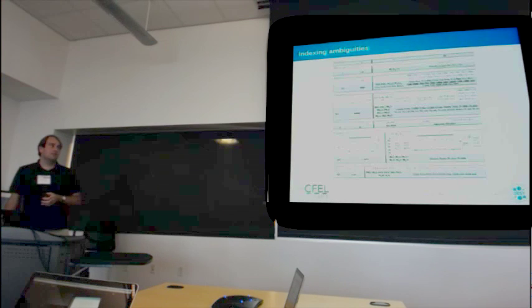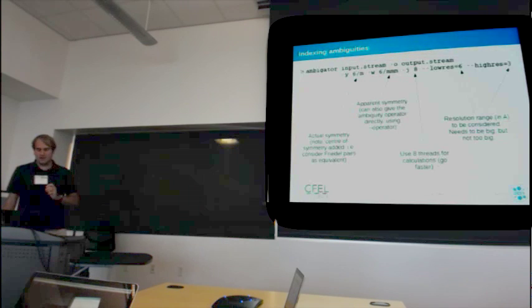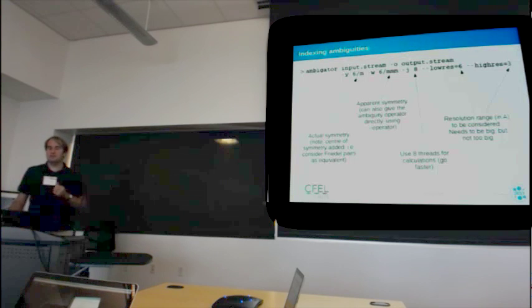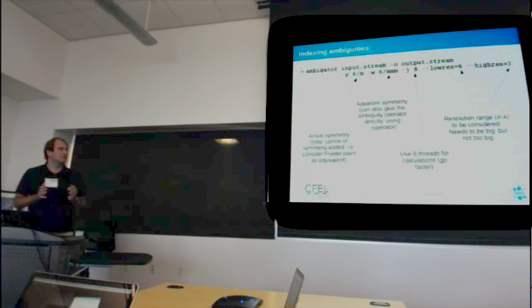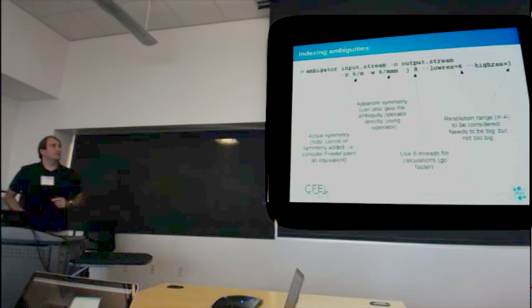There is an algorithm now, thanks to work in Wisconsin, to resolve this ambiguity. That's implemented in CrystFEL in the program Ambigator. It's really easy to use, it's really fast, and huge thanks to Wolfgang Brehm for coming to Hamburg for a really intense couple of days implementing this algorithm to his very high standards of mathematical rigor and efficiency. It's really fantastic. Here's how you use it.